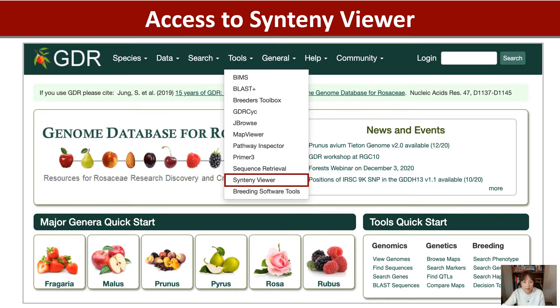To access Synteny Viewer, you click Tools in the header bar, and then click Synteny Viewer.